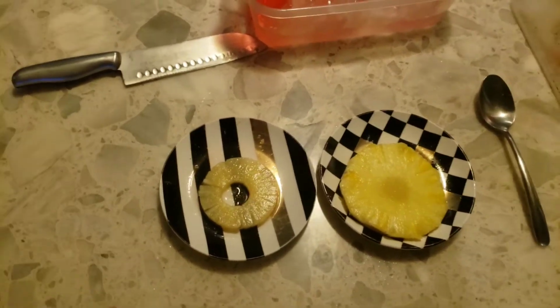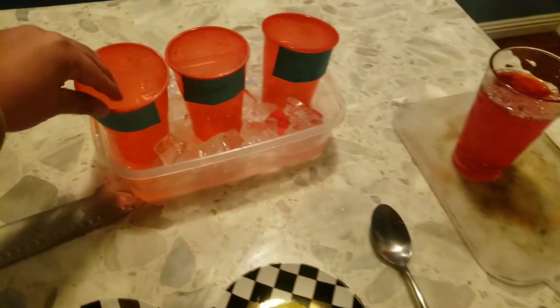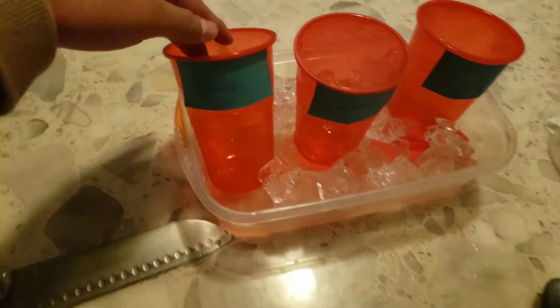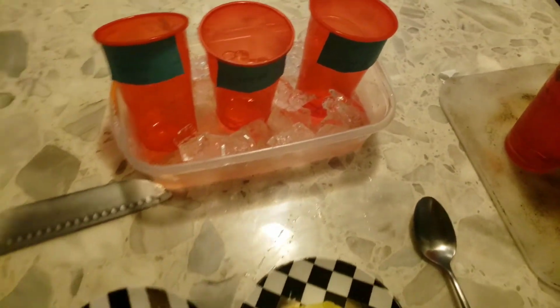Hello, my name is Ramiro and I'll be doing the pineapple and enzyme lab. My materials are canned pineapple, fresh pineapple, the gelatin there, and 3 plastic cups, each labeled fresh, canned, and no pineapple, inside a tub of ice.